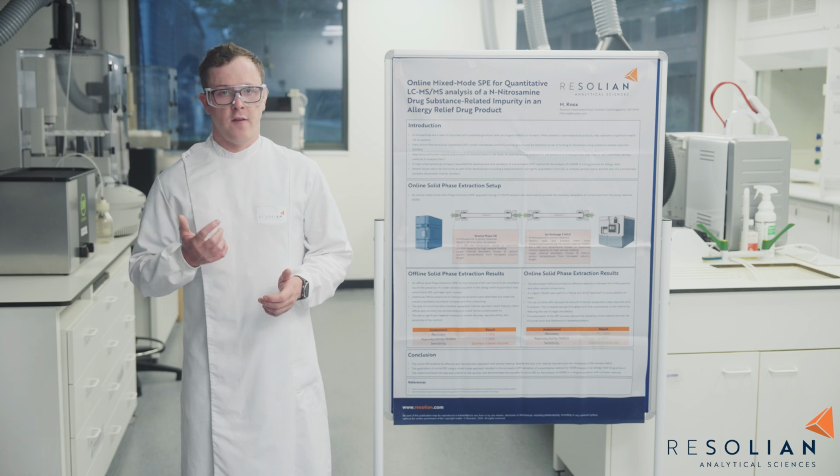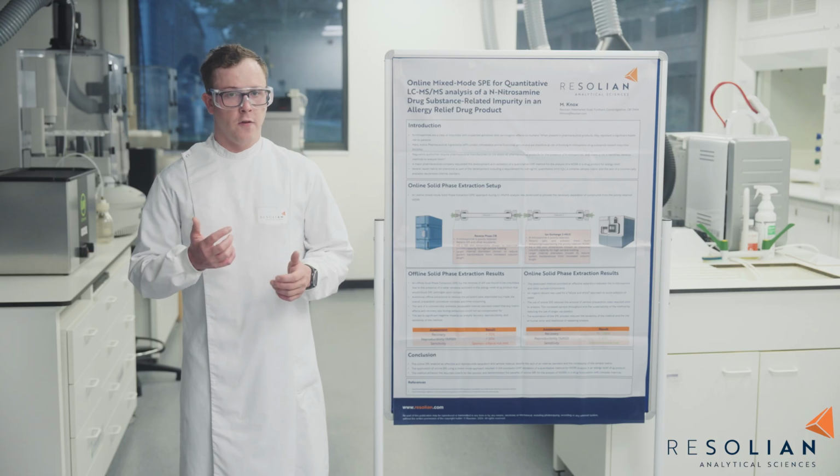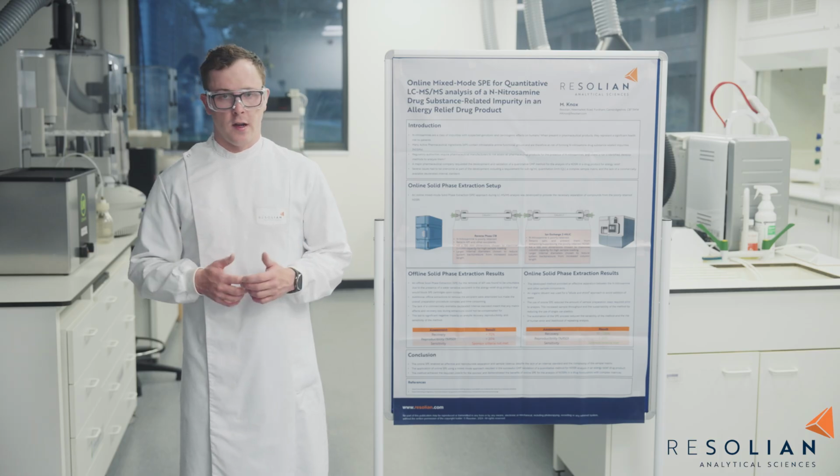The reverse phase C18 column retained the API and other excipients, while the analyte was poorly retained. Then, with this separation, the injection moved to the normal phase HILIC column, where the salts were retained and the analyte was not. This prevented the salts from enhancing or suppressing the analyte.